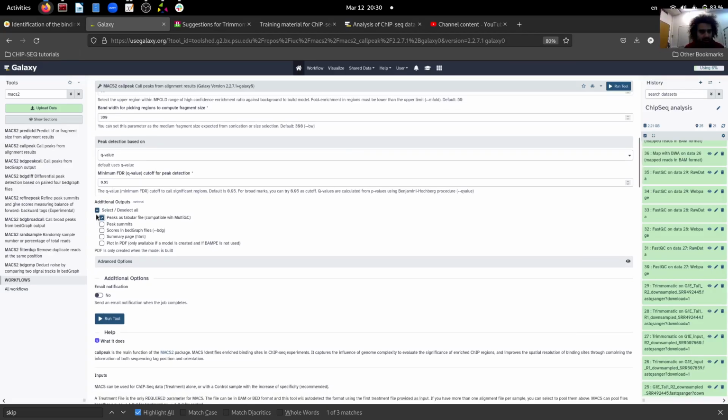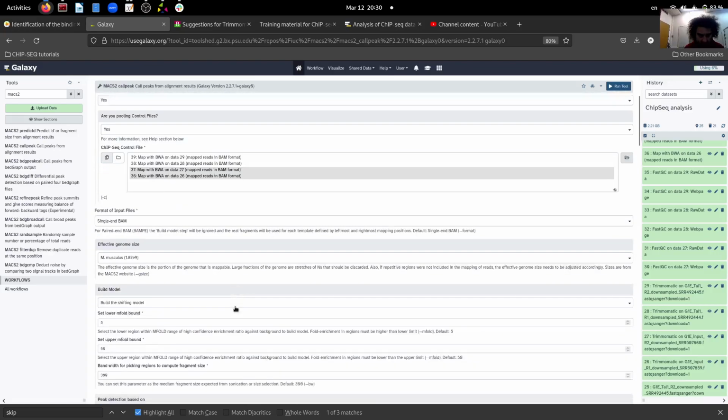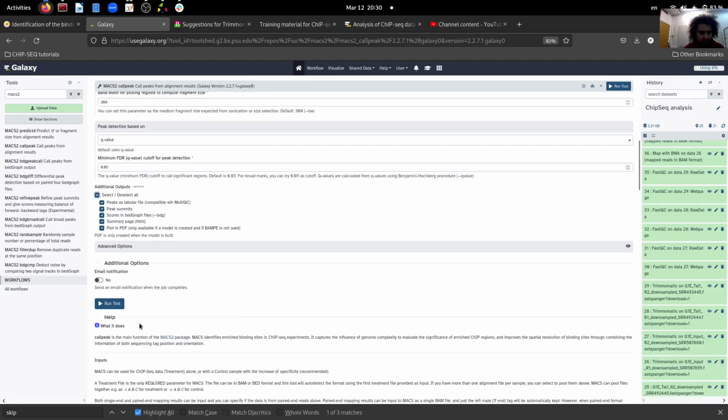They are here actually, so I think I will just choose all of them. And I think we are okay to go. I will just click Run Tool.